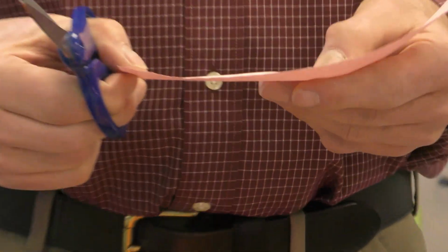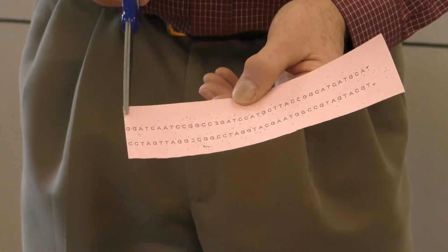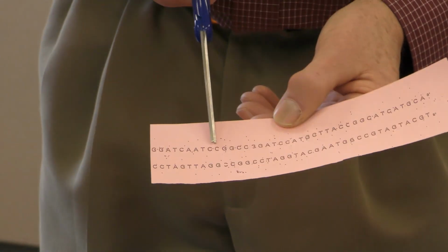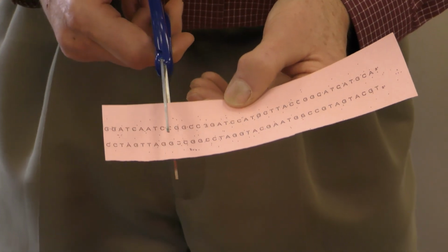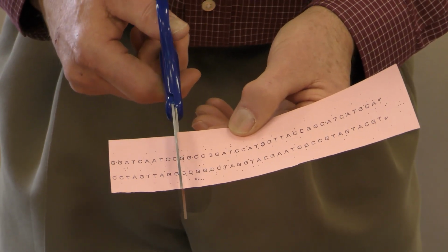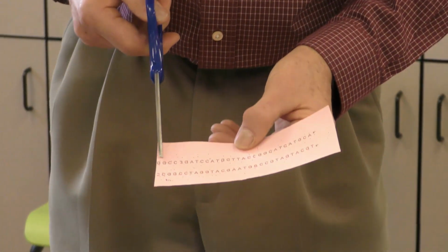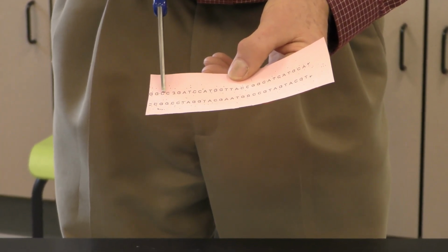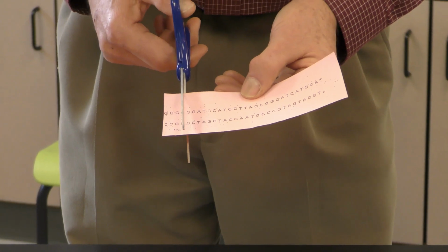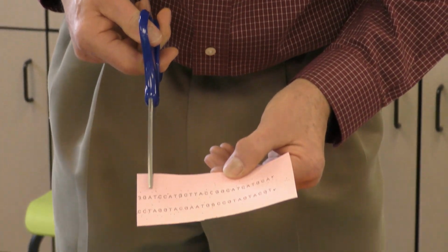Am I done yet? No, I have to look for more. Is there another restriction site along that fragment? Here's another double C, double G, and I'm going to cut again right there. Am I finished? No. I'm going to continue to read. Oh, that is actually a G right there, so it's a double C, double G. That would be another restriction site that I would cut. Are there any more?